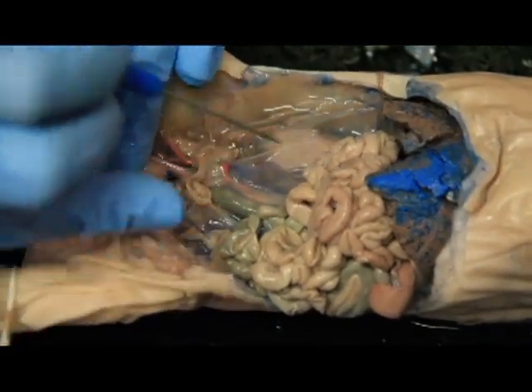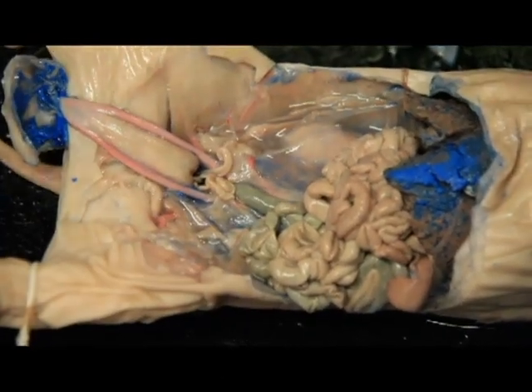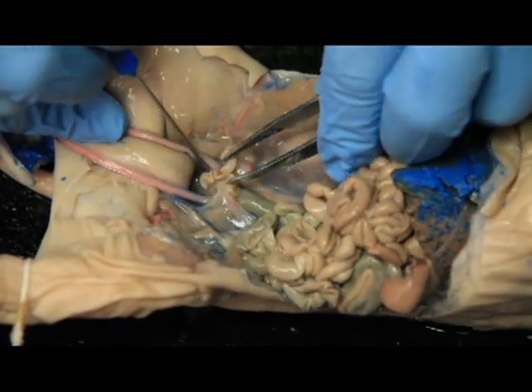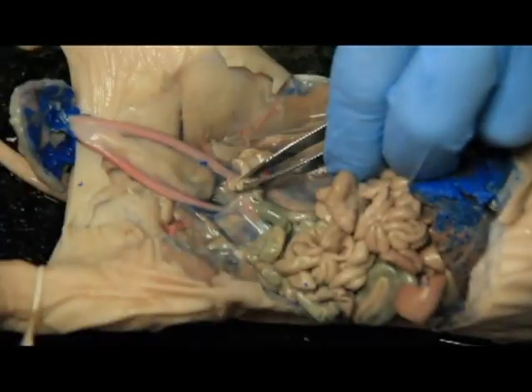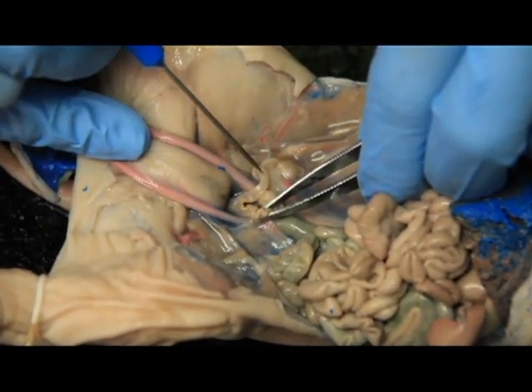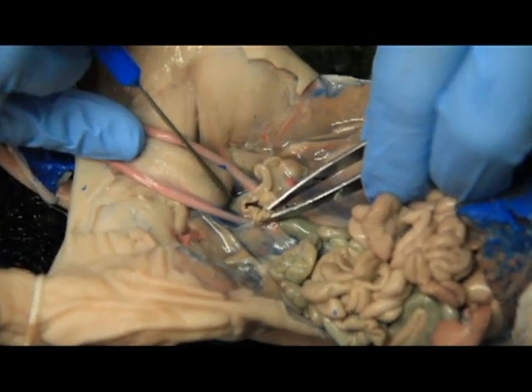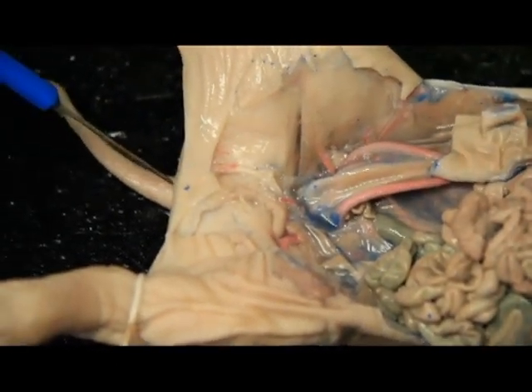Now if you were to pull this way down, you can almost see on the inside, let's see if we can pull this up a little bit. You can almost see where these branches meet. There you go. It's a little juicy. Okay? And that you can see right there. This is the base of the Y. See where these branches combine? So one arm, this body right here, that is the body of the uterus. Okay? And that's going to go all the way down and out her urogenital opening back here.